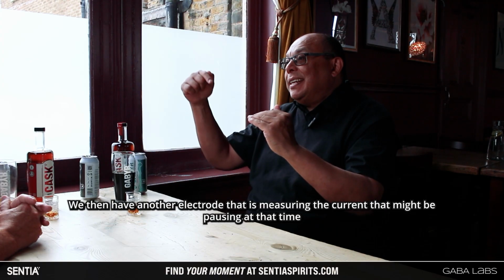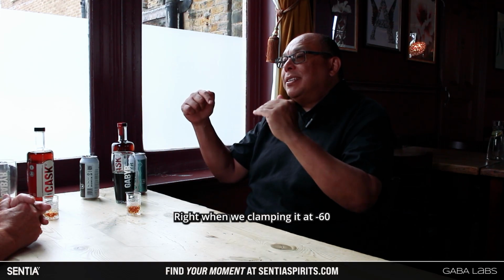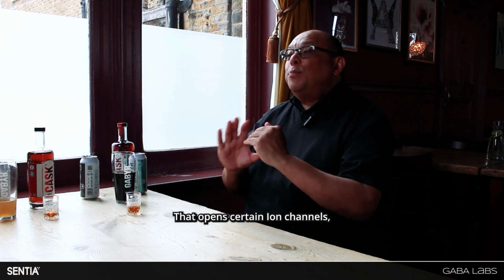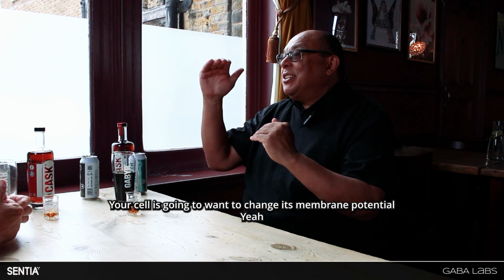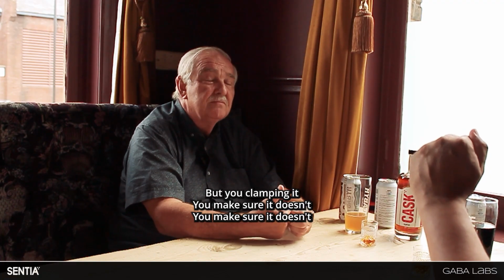We then have another electrode that is measuring the current that might be passing while we're clamping it at minus 60. If you then apply a compound that opens certain ion channels, your cell is going to want to change its membrane potential. But you're clamping it, you make sure it doesn't.